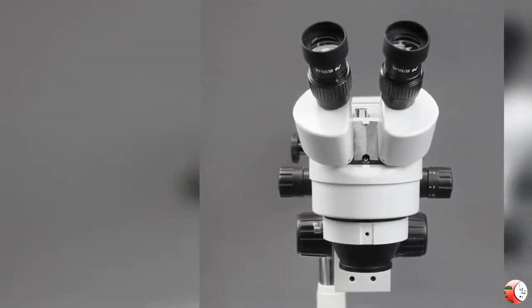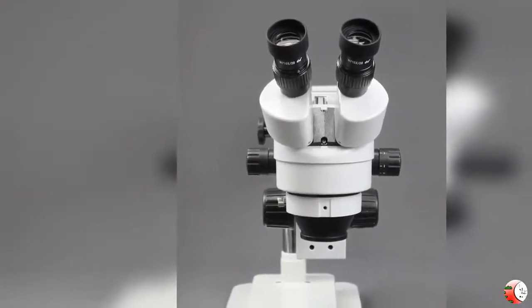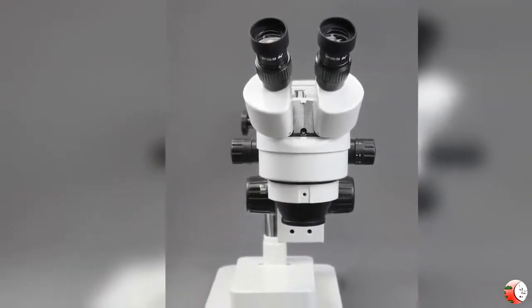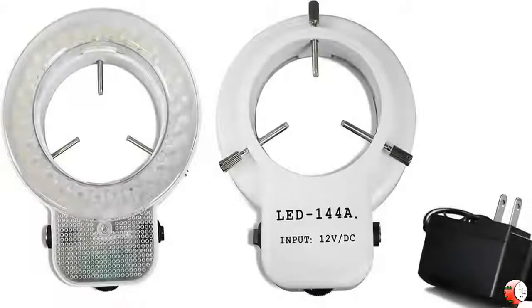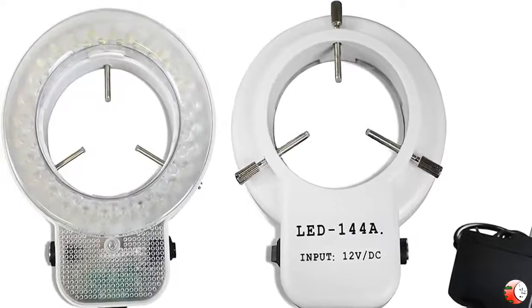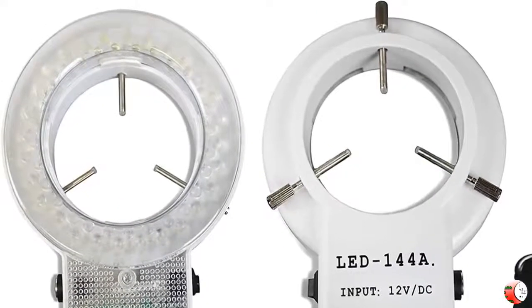4. Large and stable double-arm boom stand offers a long and flexible working distance, while the advanced ball-bearing technology allows the arm to glide with little resistance. The solid steel tabletop rectangular base provides a solid foundation to fit your observational needs.